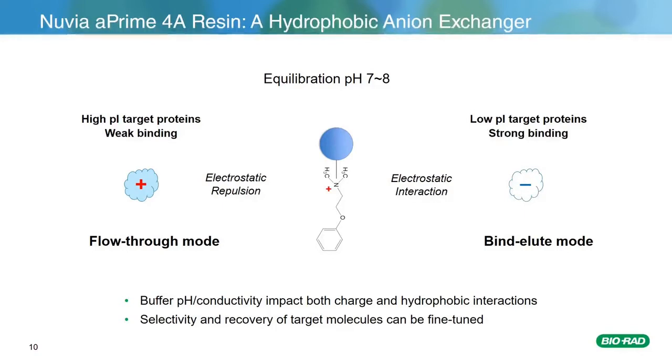Buffer pH and conductivity impact both charge and hydrophobic interactions. This allows us to fine-tune the selectivity and recovery for target protein molecules.